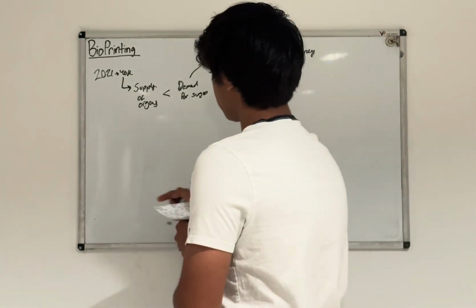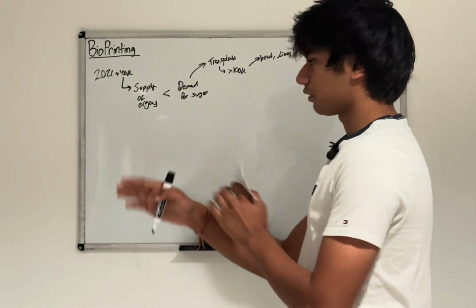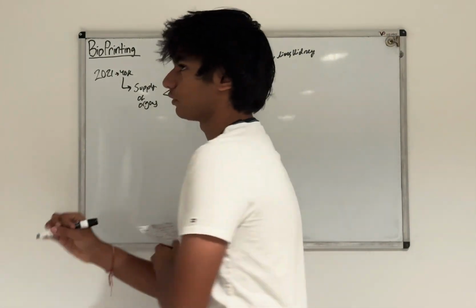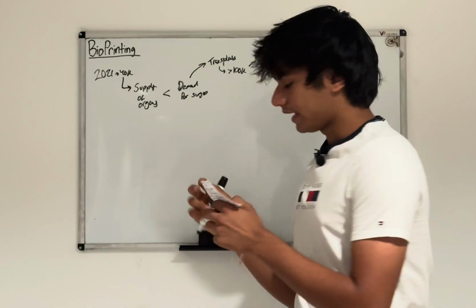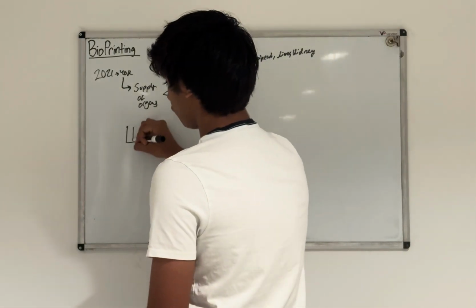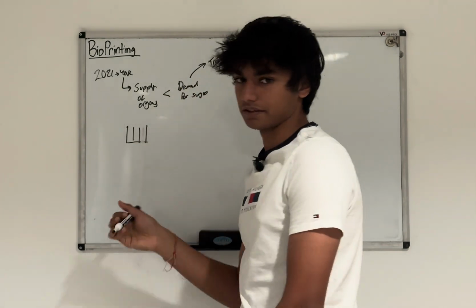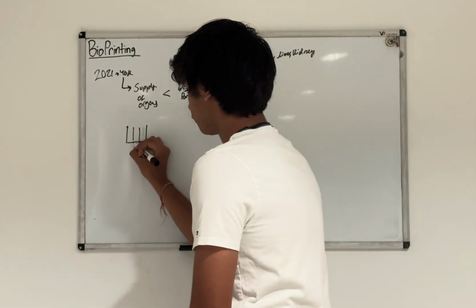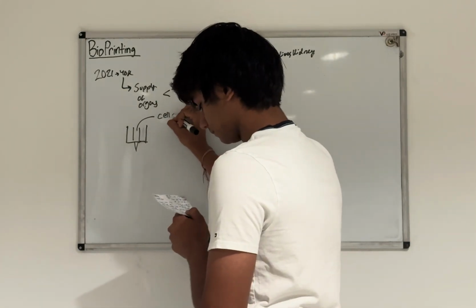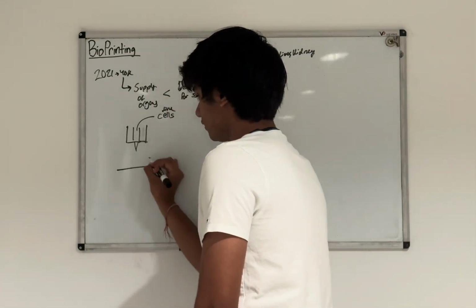Bioprinting is very similar to how plastic 3D printing works, but let's go over how it started. Researchers took an inkjet printer, just a regular paper printer, which has cartridges filled with different colors of ink. What researchers did is they took these cartridges and filled them up with live cells. Then they printed it.